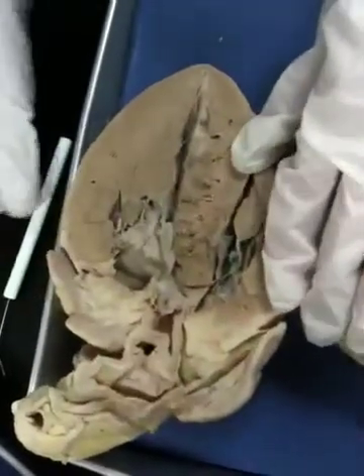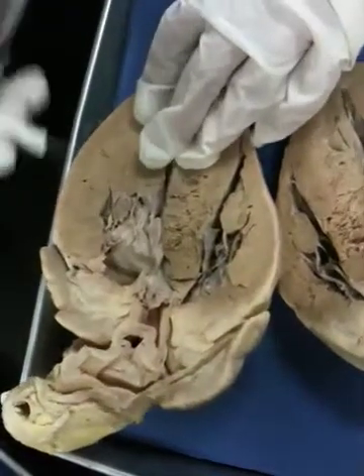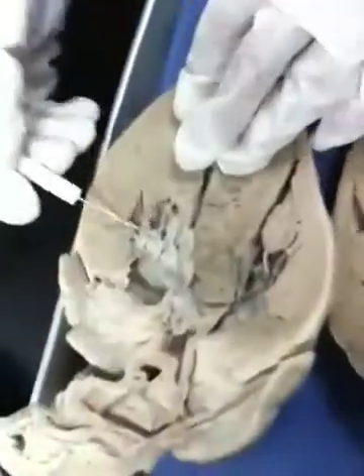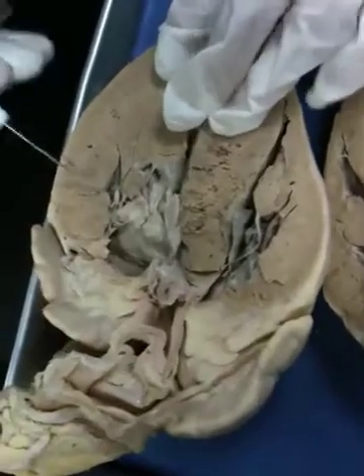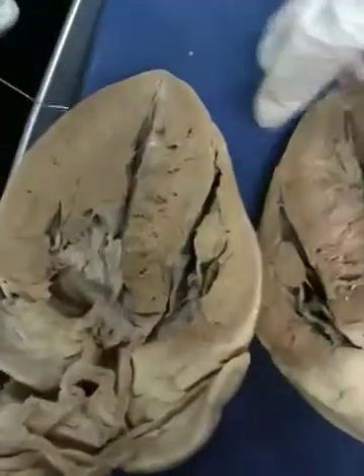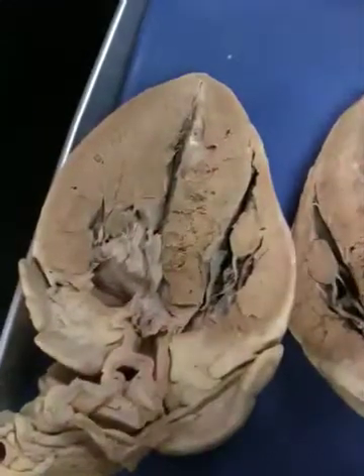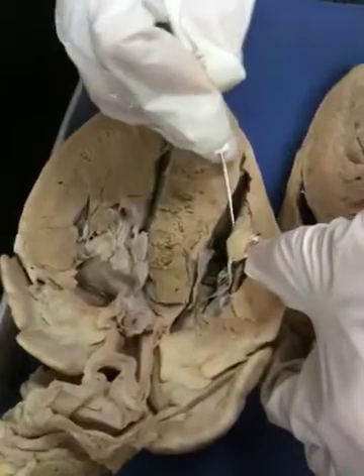Now that we've identified the chambers, we can identify the valves. On the left side, this is the bicuspid valve, also known as mitral, with nice chordae tendineae. The muscles that they attach to are the papillary muscles. You can see it's all myocardium — all this meaty stuff is the muscle, and when it projects up into the ventricle, it's called a papillary muscle.